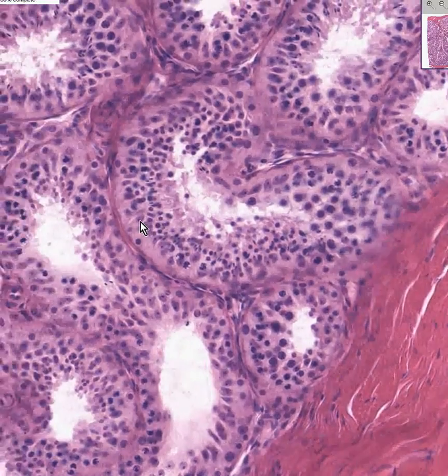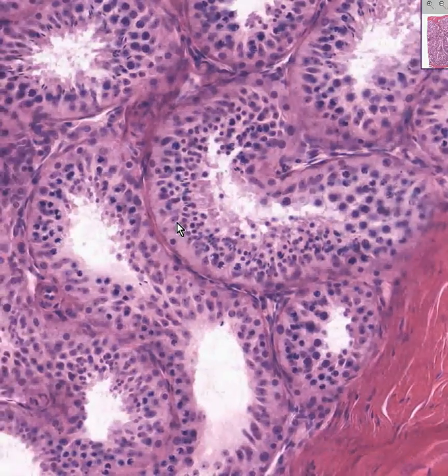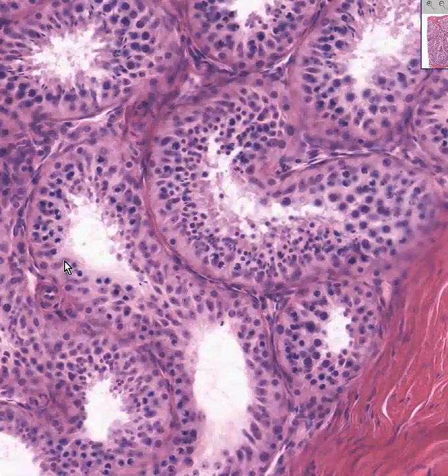Every now and then you will see nuclei which are not round, but they're a little bit spindly, and they're oriented at 90-degree angles with respect to the base. These are your Sertoli cells. They support the tubule in more ways than one. They're also called sustentacular cells, and there is a Sertoli cell there. Notice the Sertoli cell nuclei, like there, and there, and there, and probably there. They are not round, and they are not as dense as the primary spermatocytes.